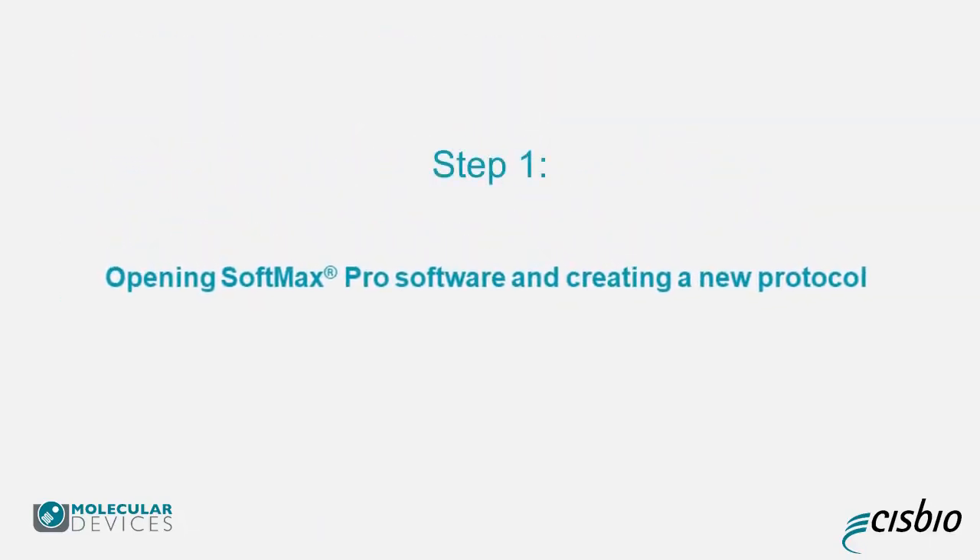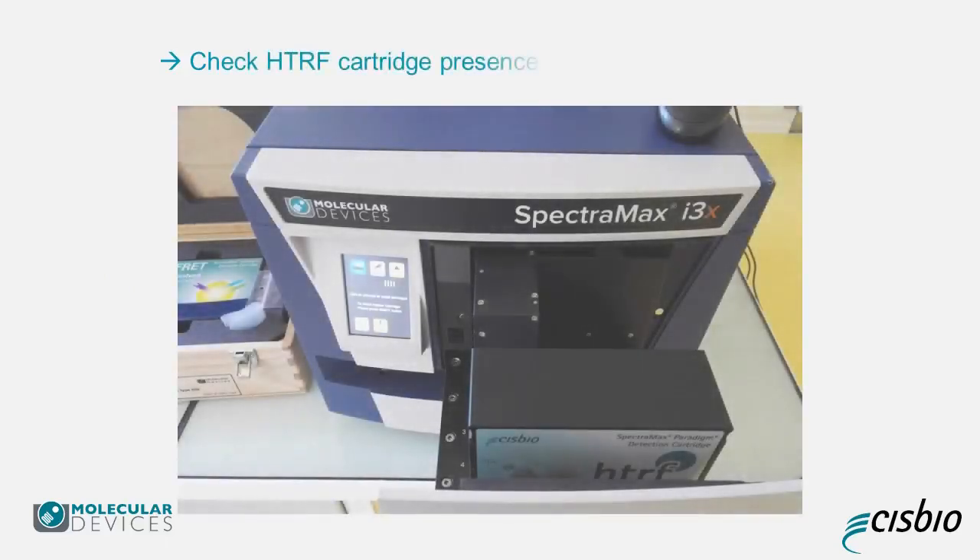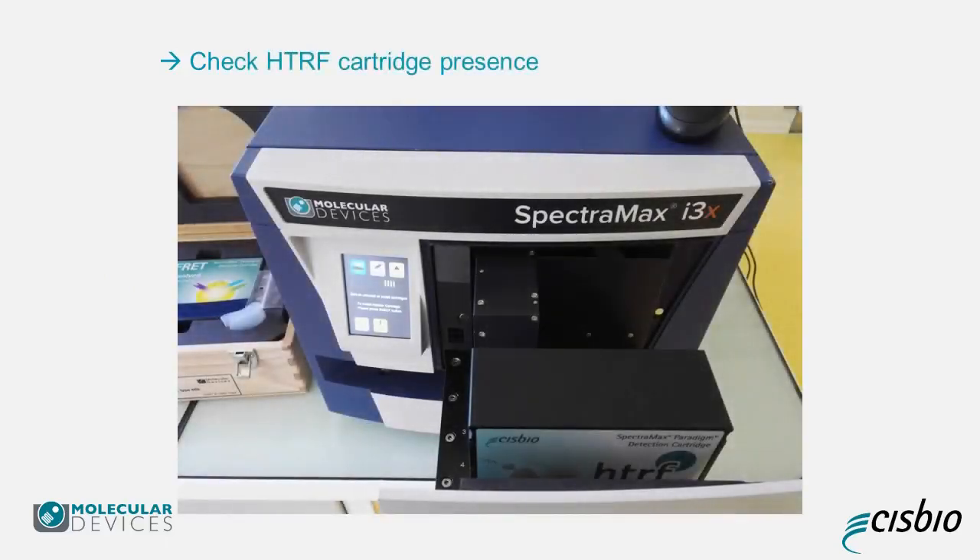Step 1: Opening Softmax Pro software and creating a new protocol. Before getting started, please check if you have the HTRF cartridge inserted. To open the drawer, press the button on the upper left of the touchscreen.